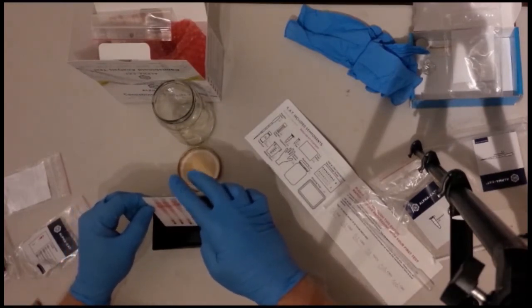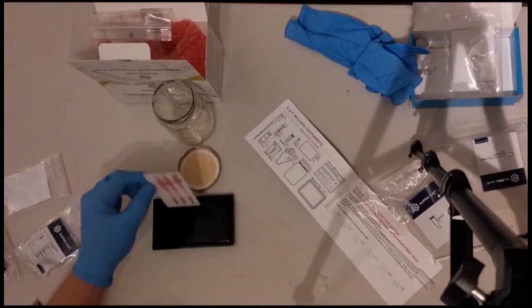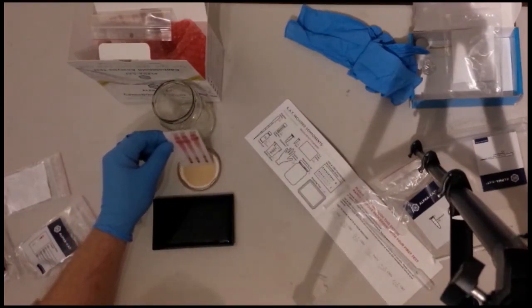As you can see, we have very clear results. The plate has reacted very well. We now leave the plate to dry for 8 minutes.